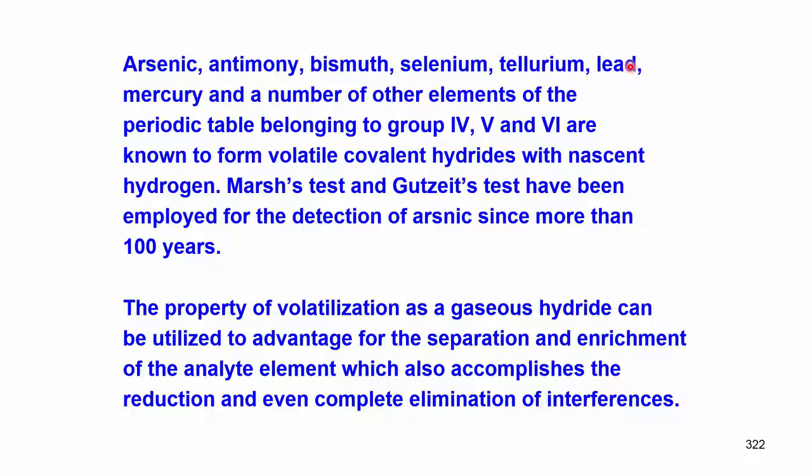This technique has been known for almost 70-80 years, and that is the generation of hydride. And the Gutzeit test also has been employed for the detection of arsenic for more than 100 years. We are using the same technology to form the hydride and introduce it into the flame.